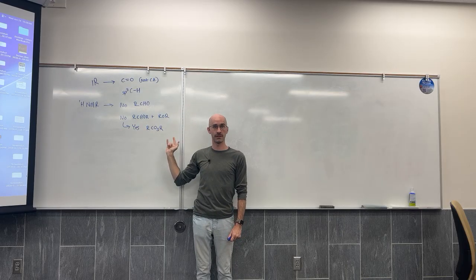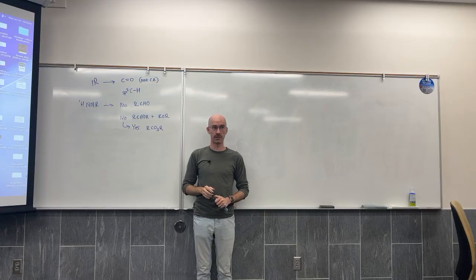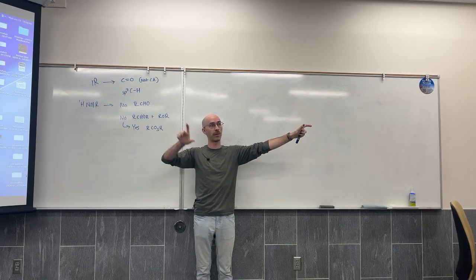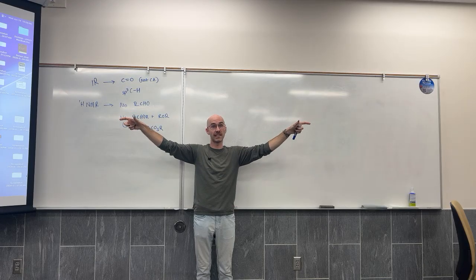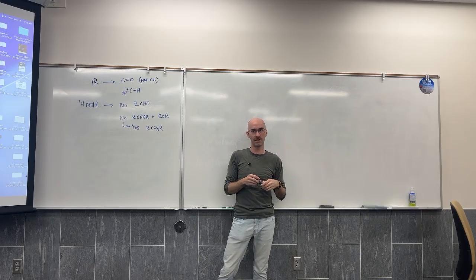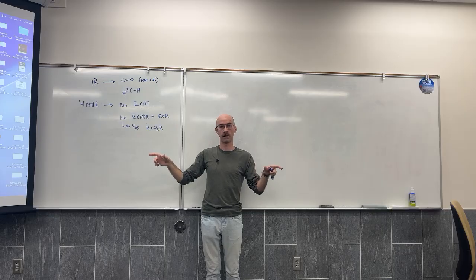An ester has signals next to an oxygen and a signal next to a carbonyl, which do show up in different regions. So the ester doesn't have a signal that shows up in a single spot, but an ester has an oxygen adjacent group and a carbonyl adjacent group, and those show up in different chemical shifts. Whereas the ketone has two carbonyl adjacent groups, an ether has two oxygen adjacent groups, and I'm not seeing evidence of two oxygen adjacent, two carbonyl adjacent. I'm seeing evidence of one oxygen adjacent, one carbonyl adjacent.